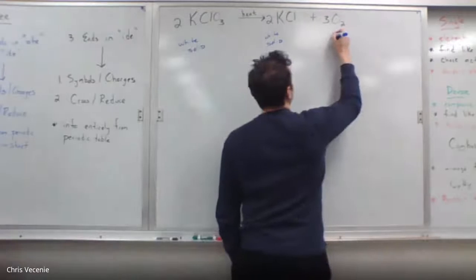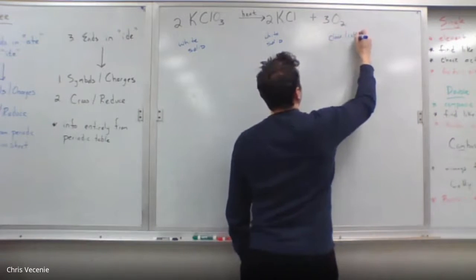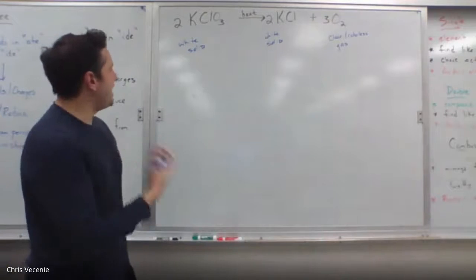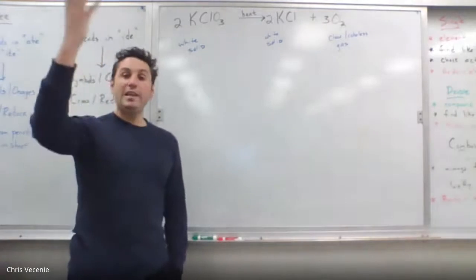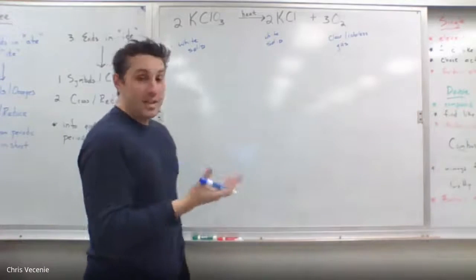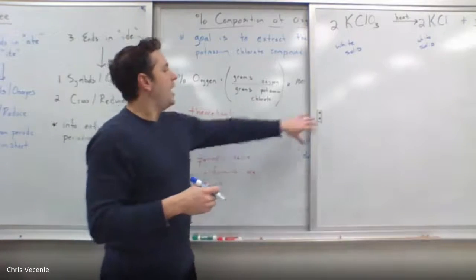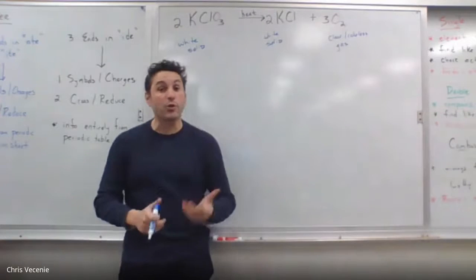Oxygen is a clear, colorless gas. So what's going to happen is as I heat the KClO3, I am going to convince the oxygen to leave the compound. So this is kind of unique in the sense that I need to measure how much oxygen there is, the grams of oxygen for this problem. But you're going to say, well, how do you catch the oxygen? It's a gas that's leaving. And the answer is we're not, right?